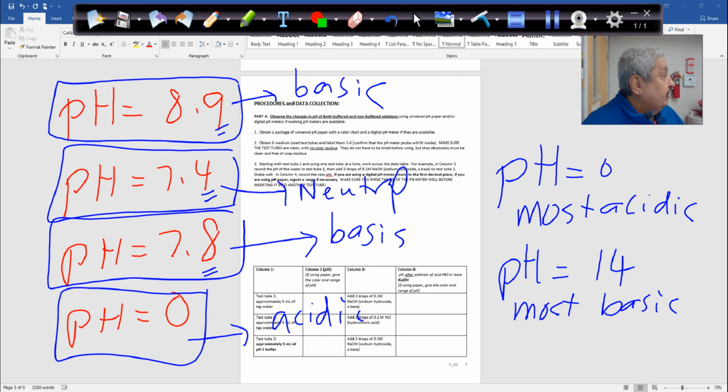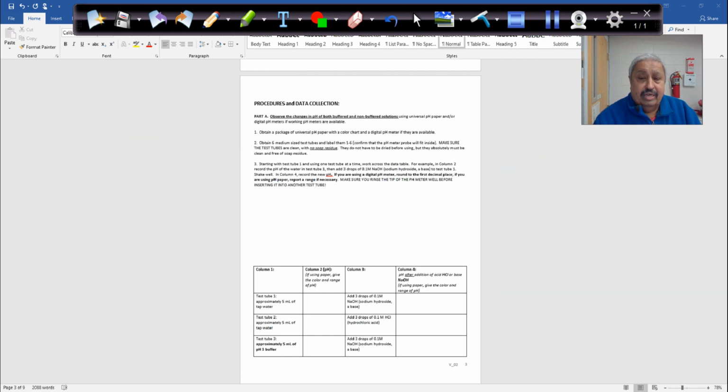Okay, guys. So we'll do some calculations here. We'll talk about the buffer, and then I will look at the experiment itself. The experiment should not take long. I have the results for you already. Without even doing the experiment, I can predict the values where they can be. So let me take this one out and then look at the buffer.